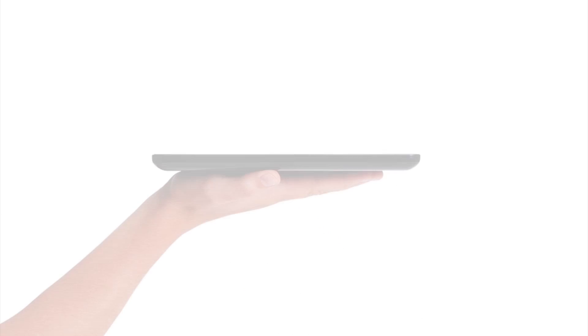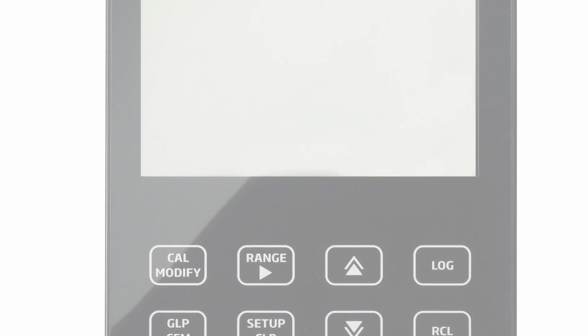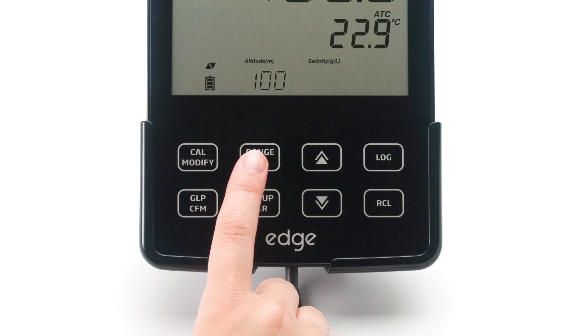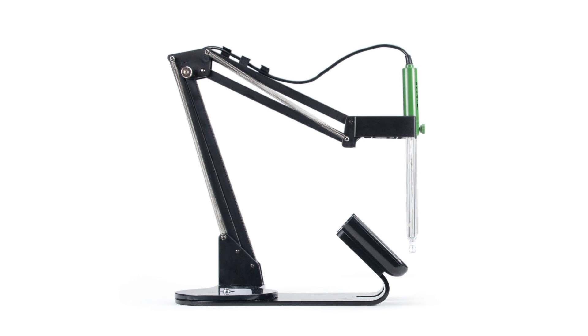EDGE is incredibly thin and lightweight, measuring a half-inch thick and weighing only 8.8 ounces. EDGE features a 5.5-inch LCD display that can clearly be viewed from over 5 meters away, and a capacitive touch keypad that gives a distinctive, modern look. Its benchtop cradle is equipped with an adjustable swivel electrode holder to charge and hold EDGE securely in place at the optimum viewing angle.